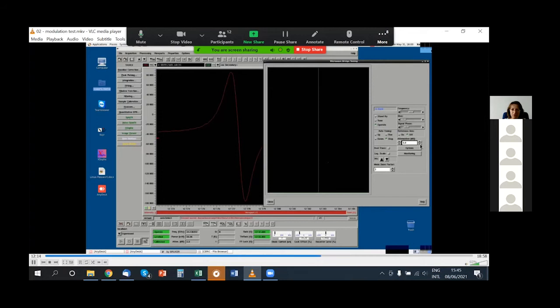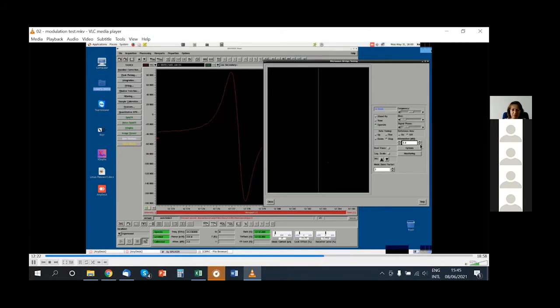We check it from time to time to be sure the cavity is clean, because EPR is so sensitive, you wouldn't like to have some impurities in the cavity. And also sometimes after low temperature measurement, it's possible to have some moisture in the cavity, which is really bad.